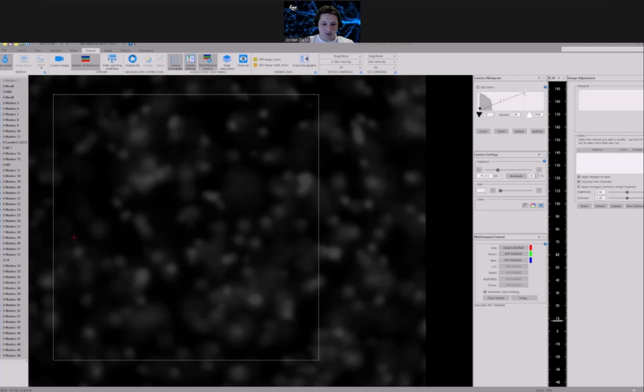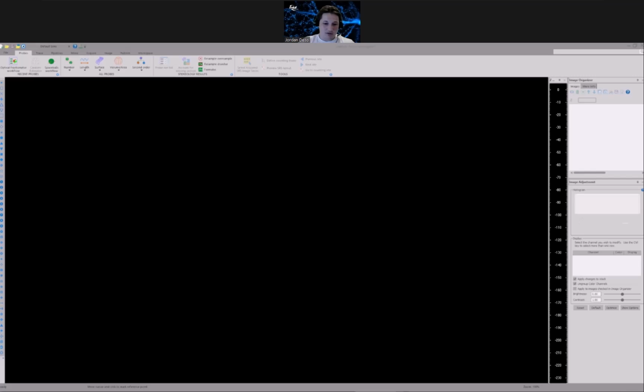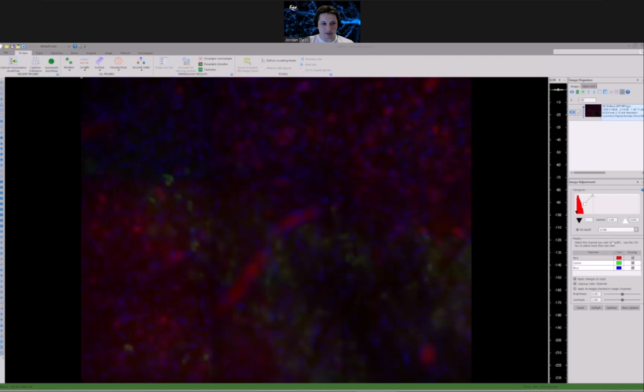So in this example, the algorithm is taking nearly 100 images, with 11 being taken at each of the 9 tiles, whereas if this were a 2D 3x3 slide scan, the software would have only needed to take 9 images total. After the scan is complete and compiled, I'm going to start by reopening the produced image, and from here, we can go through the individual planes in the stack that was obtainable from the 3D slide scan.